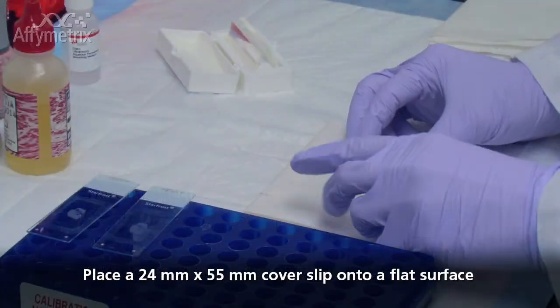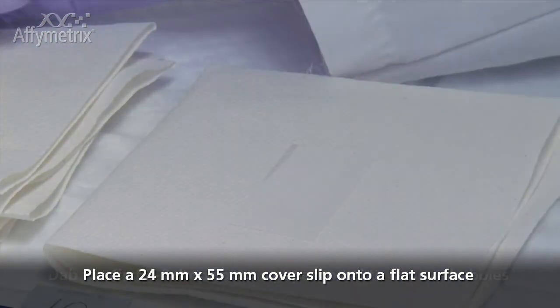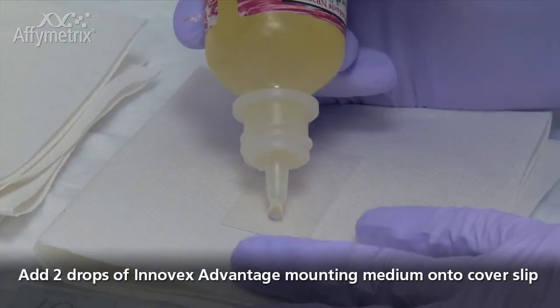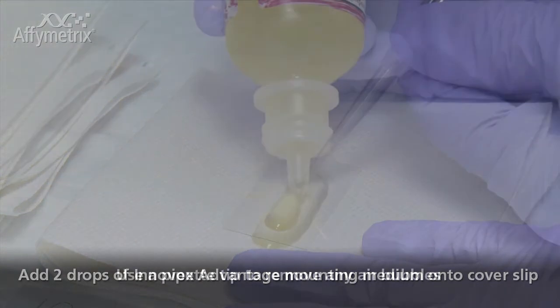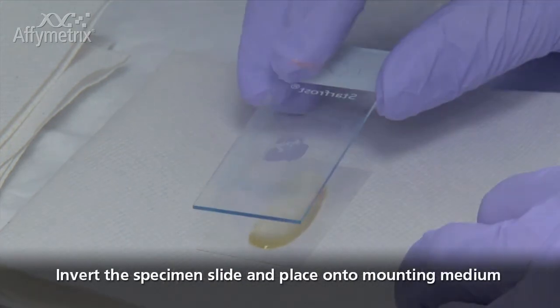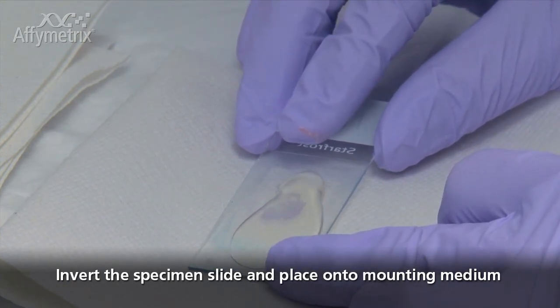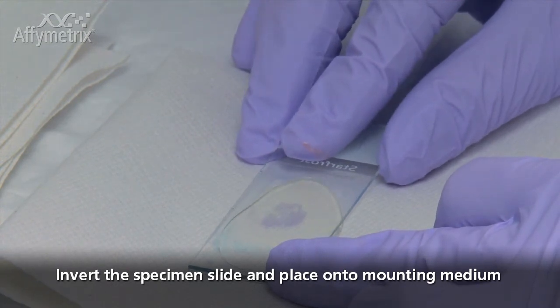Place a 24mm by 55mm cover slip horizontally on a clean flat surface. Dab the first two to three drops of mounting media onto a paper towel to remove bubbles. Add two drops of the Inovex Advantage Mounting Medium directly onto the middle of the cover slip. Use a pipette tip to draw any air bubbles in the droplets. Invert the specimen slide and slowly place it onto the mounting medium at an angle. Make sure the tissue comes into contact with the mounting medium first before completely letting go of the glass slide to overlap with the cover slip.